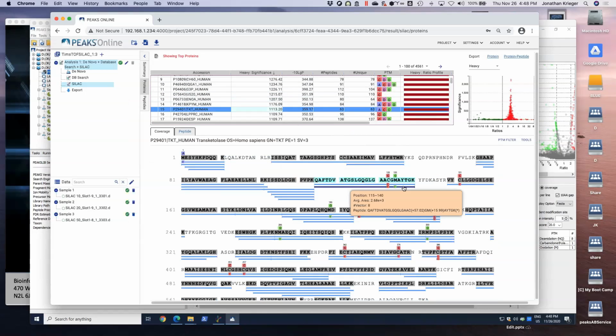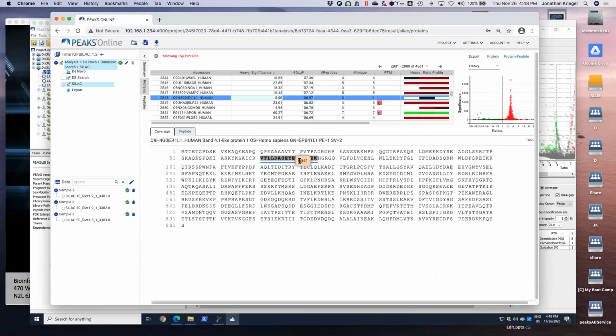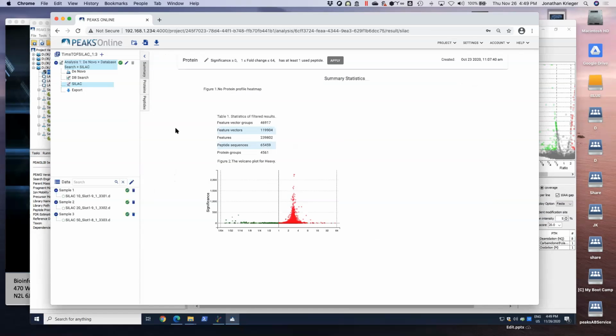It's the same thing in Studio. If we went down into something perhaps closer to a 1:1, if there is anything down here. These are typically the one peptide, low level IDs. So again, 1E2, really low level. And so, especially with timsTOF, I think it's important to really know your data.